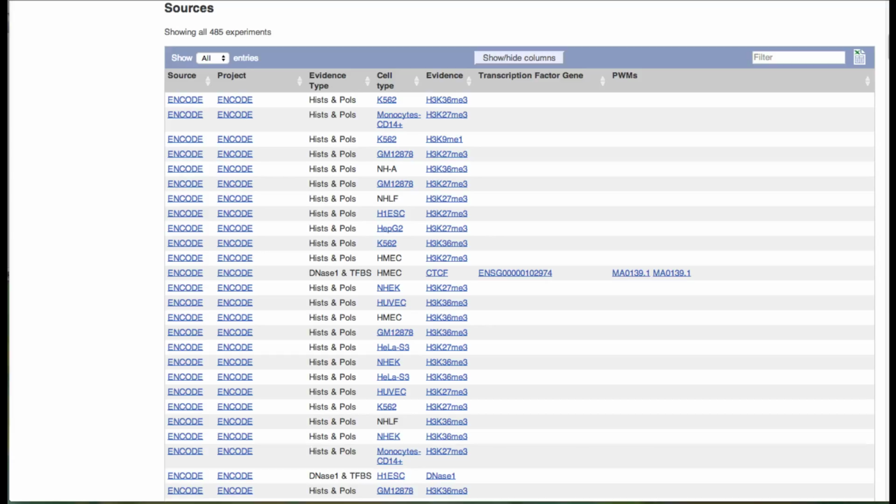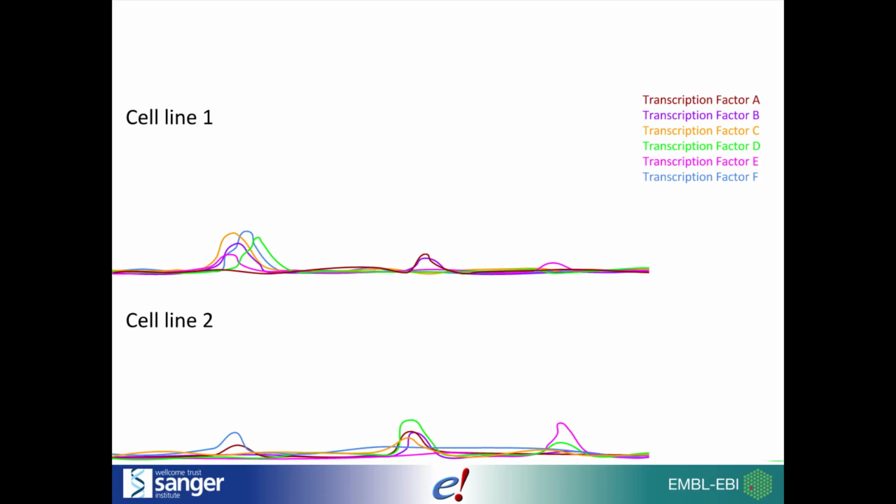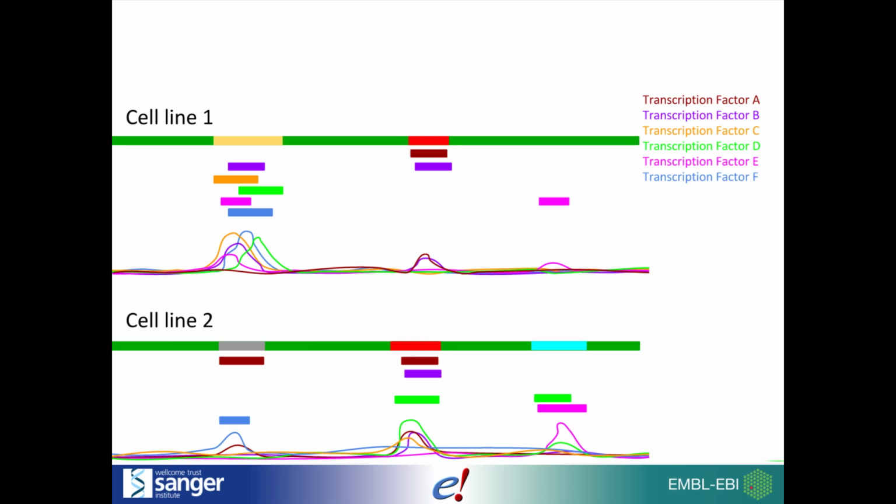Most of the raw data we have is from ChIP-seq, but we also have data from DNase 1 sensitivity and bisulfite sequencing. We also have all of these data available as raw reads, but we process them to produce what we call features and segmentation. Firstly, we call peaks on all of the reads in each cell line. We then use the signals to segment the genome in each cell line. When we do this, we're looking for patterns in the signal, finding which signals tend to co-localize with each other. We can then categorize these co-localizations into segments with particular regulatory functions, such as promoter or enhancer activity.